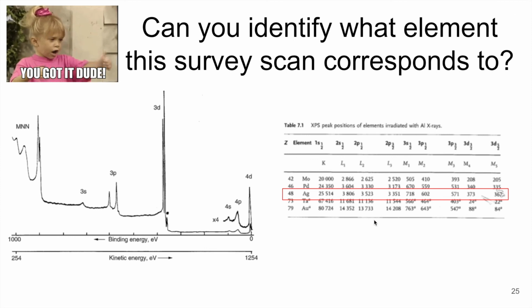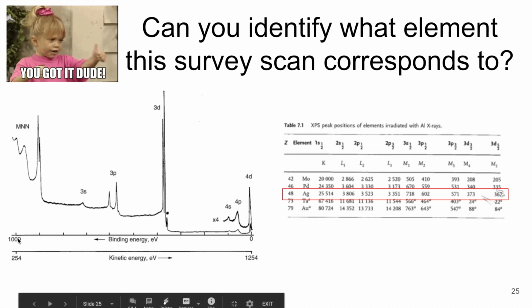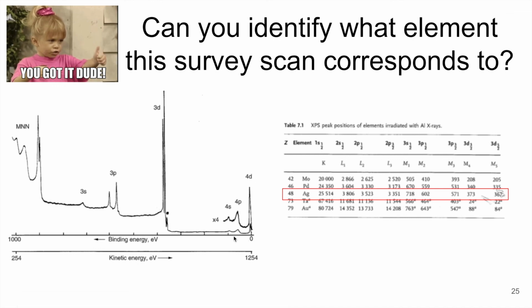And if we look at the various elements, they're going to have multiple positions. And so if you find one value and then trace it back. So if we maybe start with this biggest peak here, which is labeled as a 3D, it goes from 0 to 1,000. It's not written entirely well, but let's say 1, 2, 3, and then maybe about 370 or so, 375. And so if we look at D values for that, we see that this is around 3. The closest one appears to be this 373.